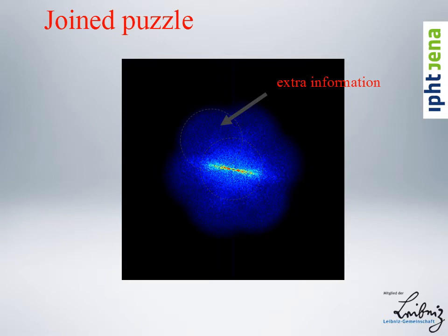And it looks like this. I've indicated the original Abbe border here, and now the new clover-leaf shaped border of frequency, which is almost isotropic and almost twice, well, strictly speaking, can even be a little bit more than twice, because the excitation wavelength is a little bit shorter than the emission wavelength. And yeah, this is all these extra information.